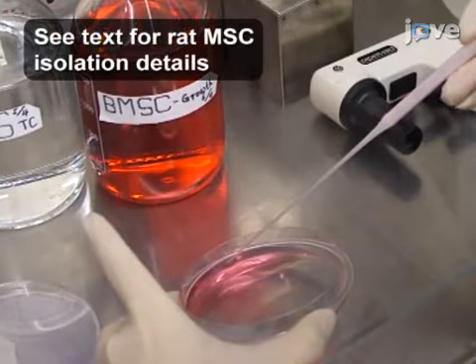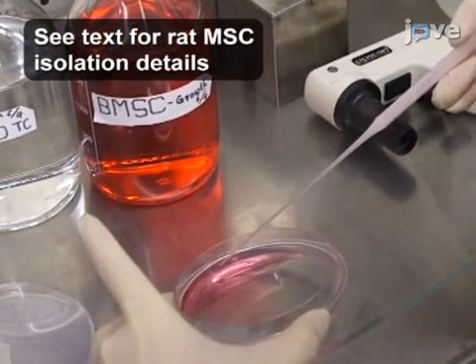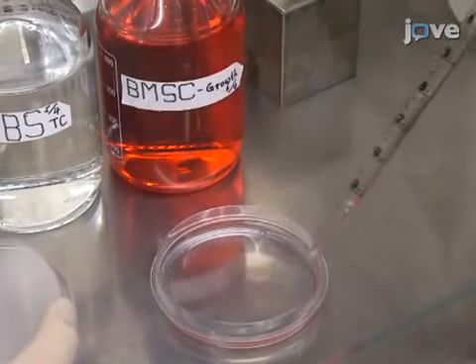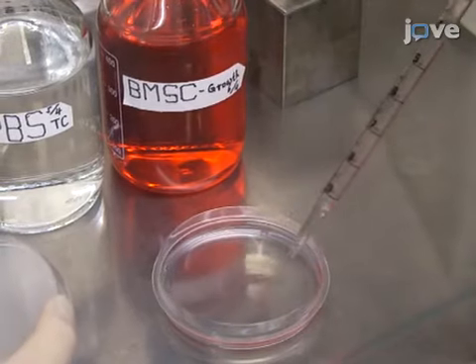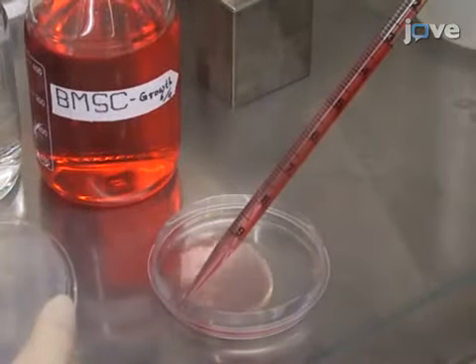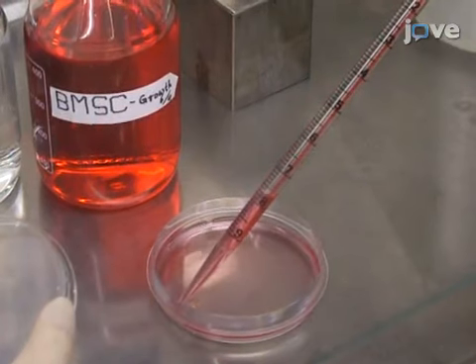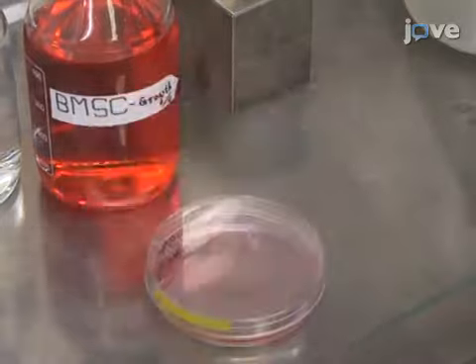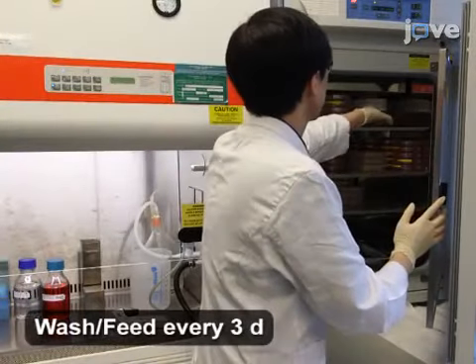After two days in culture, remove 75% of the spent medium and the non-adherent cells, and rinse the adherent cells with three 10 mL PBS washes. After the third wash, replace the PBS with 10 mL of marrow stromal cells or MSC growth medium and return the culture to the incubator.